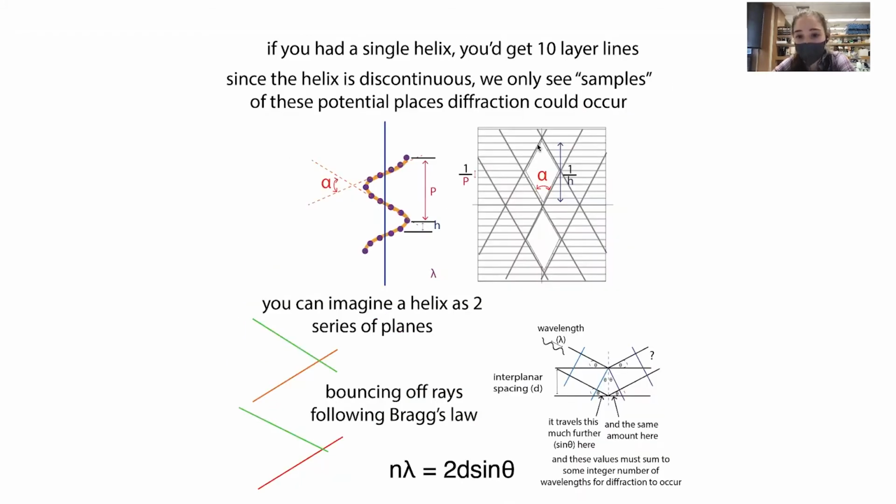You can see we have this blank space in these rhomboids, and this is helping tell them that the phosphates were on the outside. Some people thought the phosphates were on the inside and the bases were sticking out, which would make it easier to read, but it would also put all these negatively charged phosphates closer together, and put the hydrophobic bases on the outside. So that wouldn't work very well. Instead, the information can be read out in the major groove.